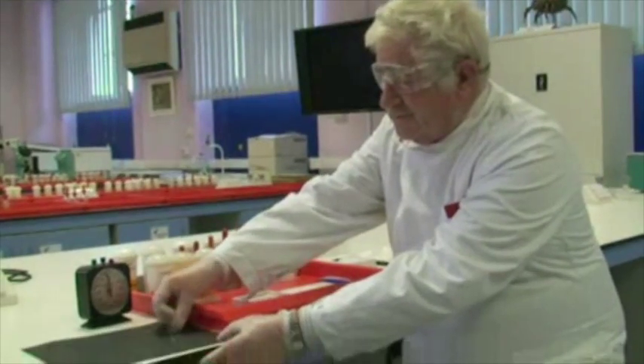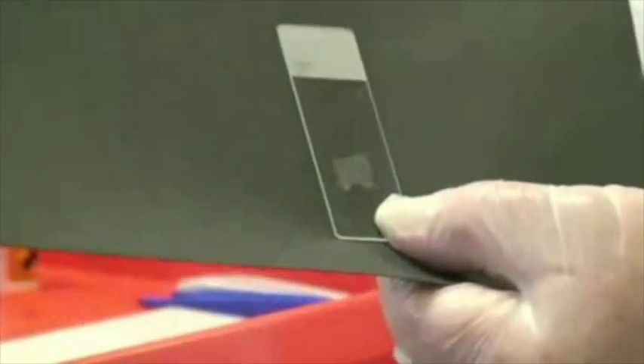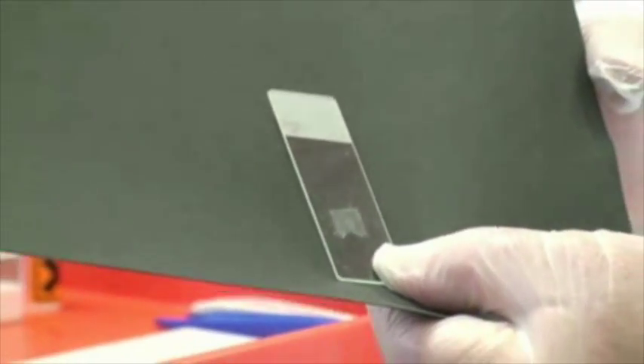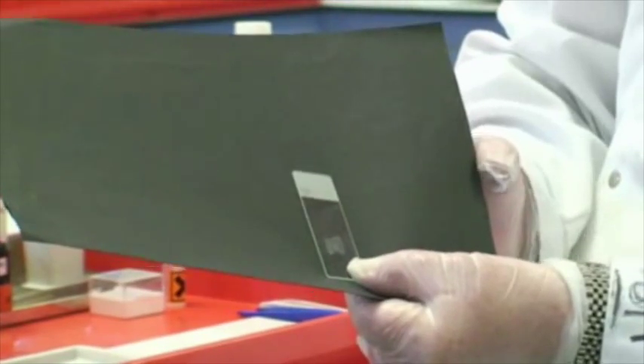Step one will be de-waxing your section. You'll notice that if you look at your slide, you will see the tissue surrounded in a coating of wax. I've already noted, using pencil — and it's important to use pencil, as I'll demonstrate later — the name of the tissue. In a teaching situation, you would also put your name on, because you will be working with a partner throughout the three years that you are doing histology in these laboratories.